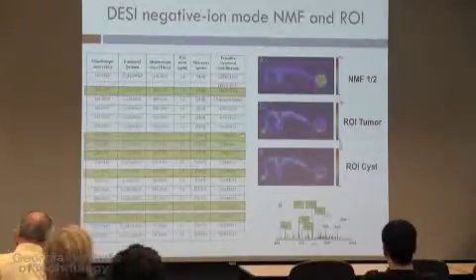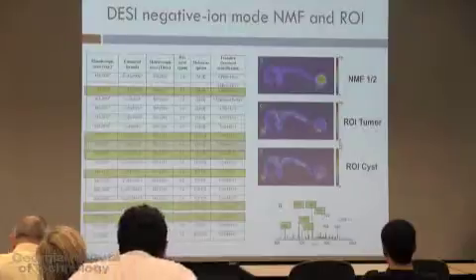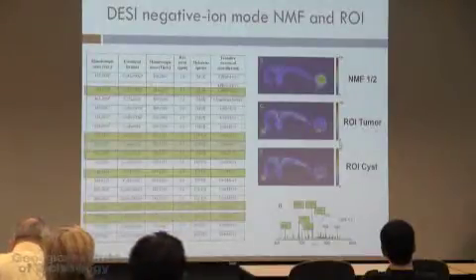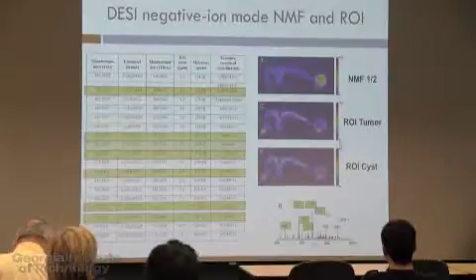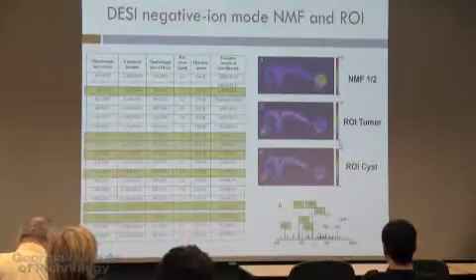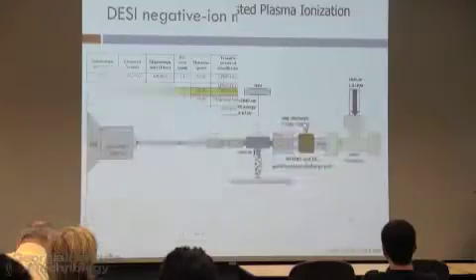For example, this one was picked for the panel. Bilirubin is also something that shows up very clearly in the tissue as being altered. But there isn't a single way of showing these alterations. That's what's interesting. There are many ways of showing these alterations. There are many ceramides. There's a cholesterol sulfate there, and we've seen some similar molecules in the other panels. So it really matches the metabolomics data.